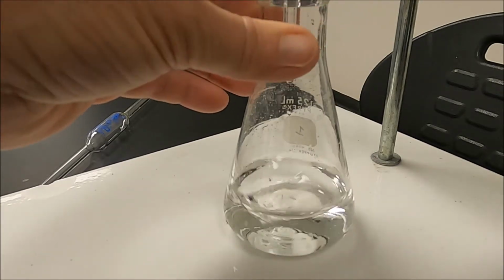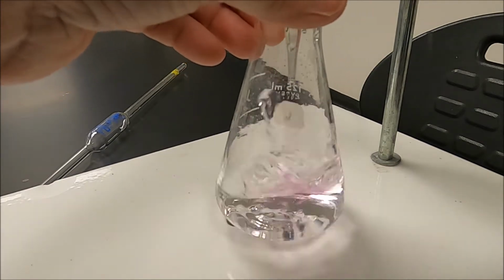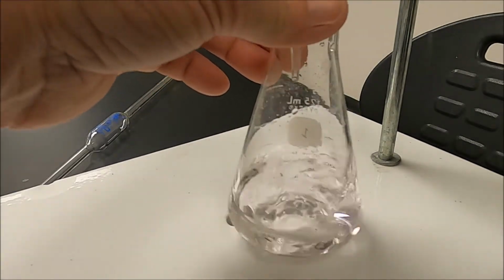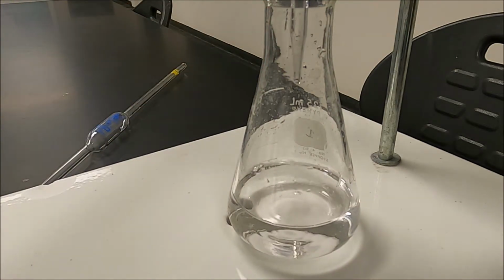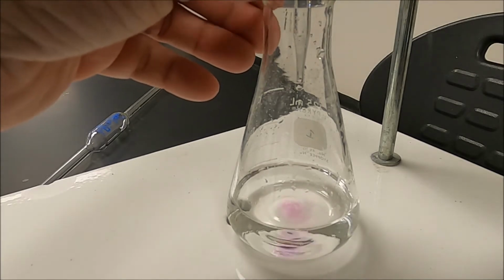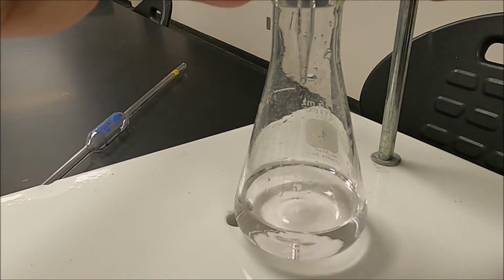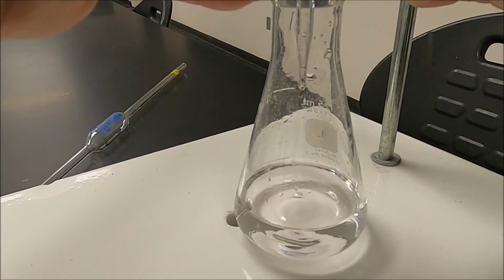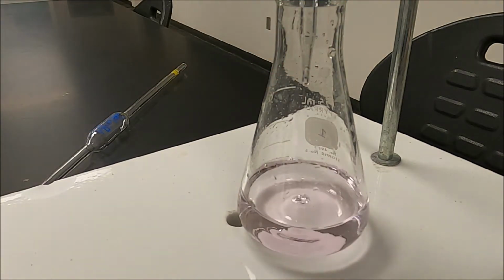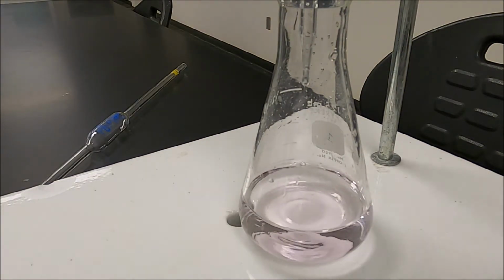Okay, now this is where a little patience comes in handy. Okay, now it's turned a pale pink and it faded away pretty quickly. So I know I'm probably within a couple of drops. So I'm just going to add a couple of drops. Okay, we're real close. Nice pale pink, and it's staying. So now we're going to go up and read our burette.